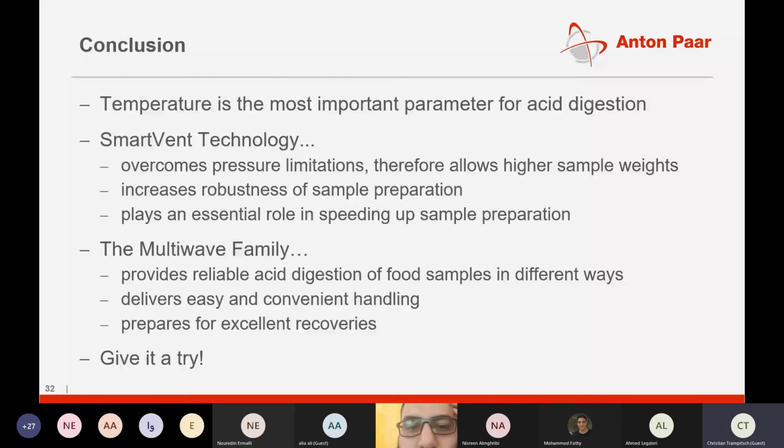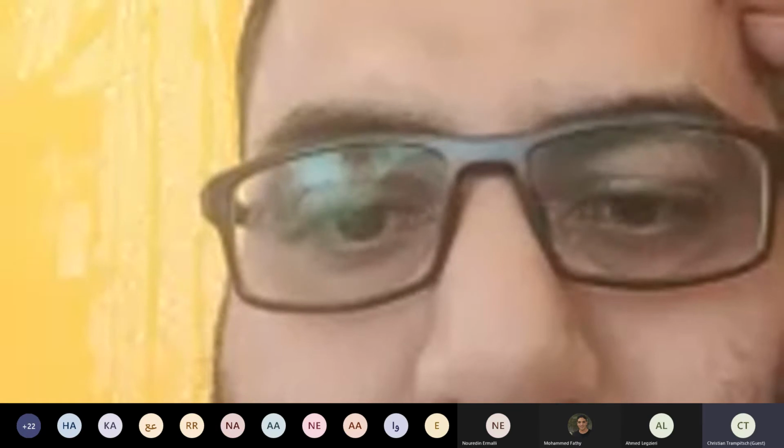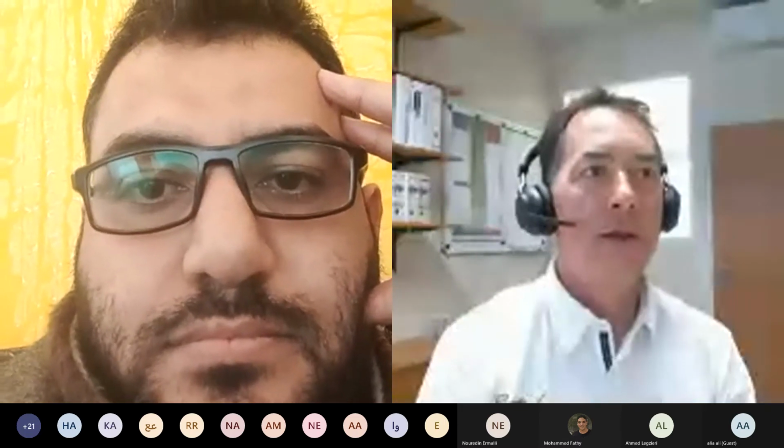Yes, there is. I will switch on my camera so that you see me. All right. The main purpose, yes, is the determination of trace metals when we do this acid digestion. I know that in food technology or in food research, we also have a lot of other parameters we want to measure, like fat content, for example.